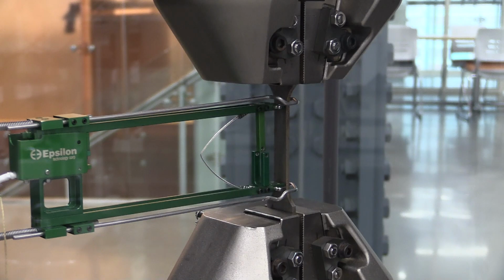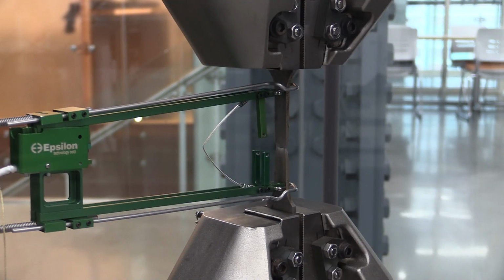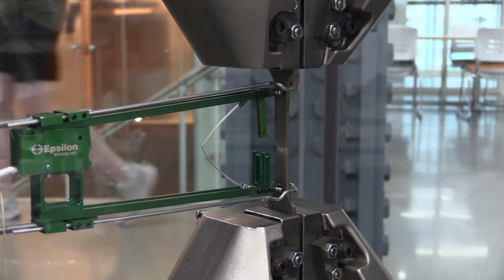And look inside, and you can see the displacement on the extensometer where the holes and the extensometers are separating. I see the necking starting there in the middle, and there it broke. You didn't hear it. You just heard a little thud.